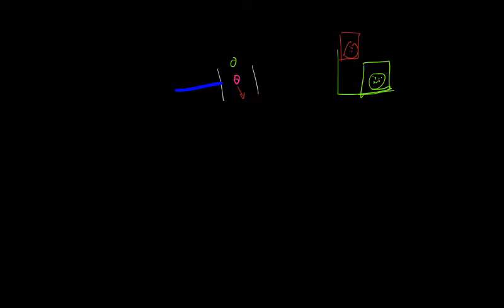The cell moves, and then what we use is called a nozzle. There are two types of stream-in-air sorter. One is cuvette based and the other is pure stream-in-air. Here I am talking about a cuvette based sorter, where the cells are illuminated in the flow cell cuvette, and as the cell exits the flow cell cuvette, there is something called a nozzle.